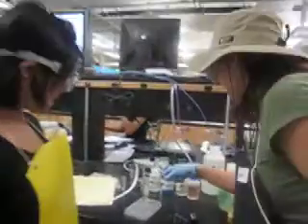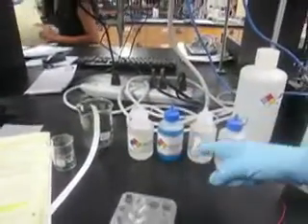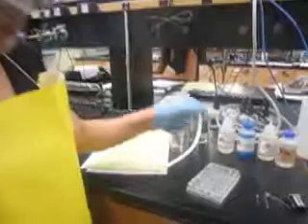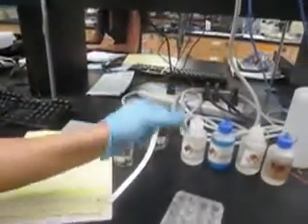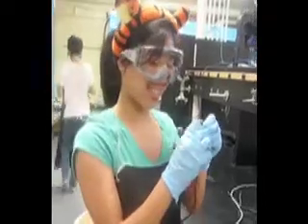But jeepers, Callygne, look at here. It looks like the Safari stock room has already provided us with zinc sulfate, copper sulfate, aluminum sulfate, and magnesium sulfate. And the metal electrodes too. Let's check that the voltmeter works. That's right. The voltage should read 0 when the probe leads are touched together.